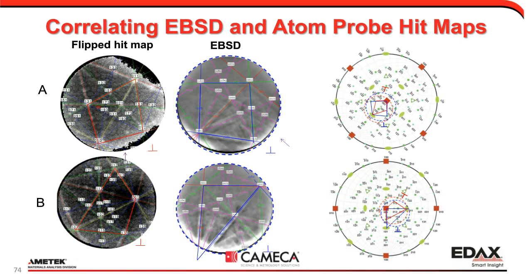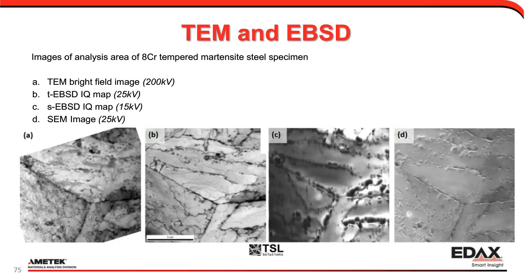Other correlations can be made with TEM. Of course, TEM is another method where we're going to get higher spatial resolution than we get with regular SEM-based diffraction.